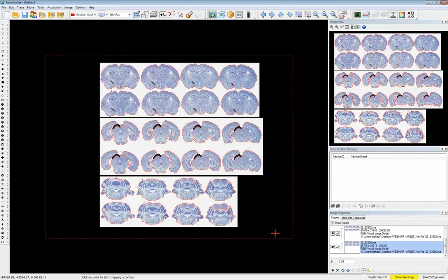Wow. Okay, well I think the detection is pretty good. I like those contours, but some of those contours have some points that I don't think should be there. So let me show you some ways to quickly edit your contours.